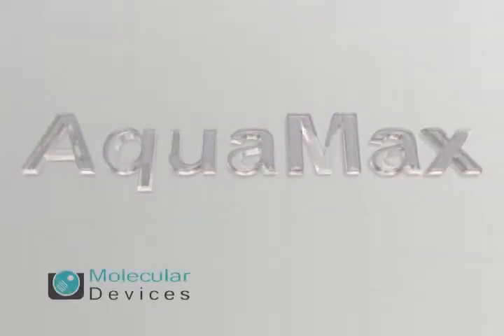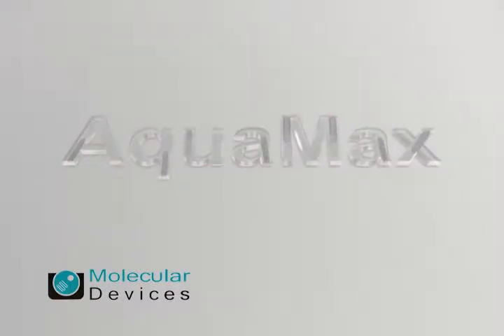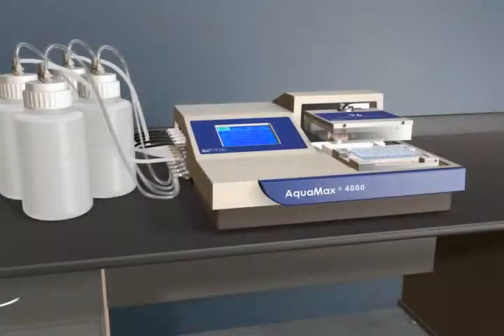The AquaMax Microplate Washer from Molecular Devices is a full-featured washer system. It is completely self-contained with no external vacuum pumps or computers.